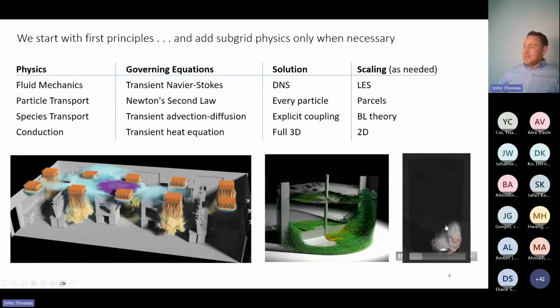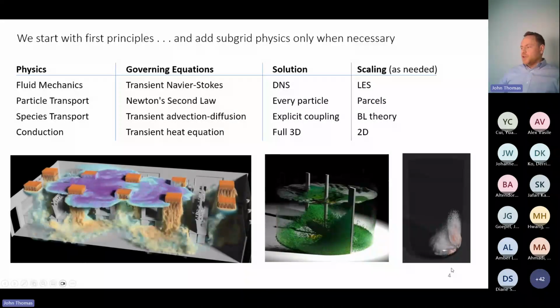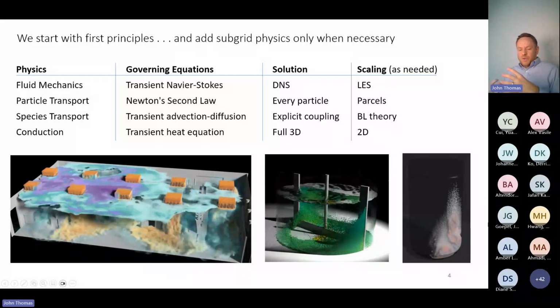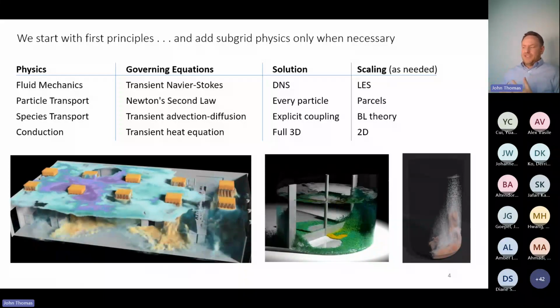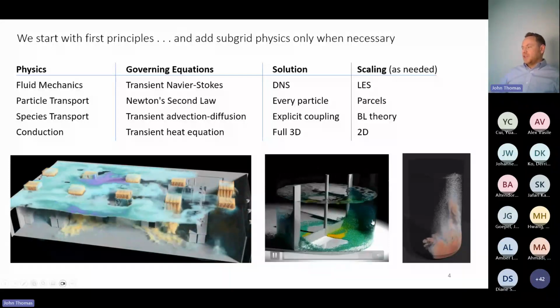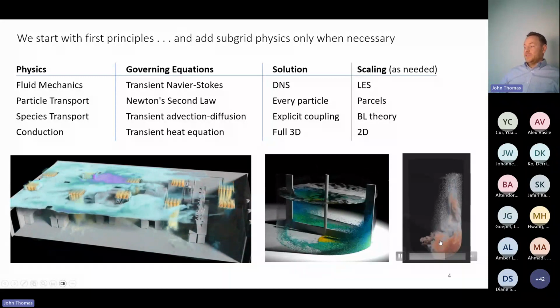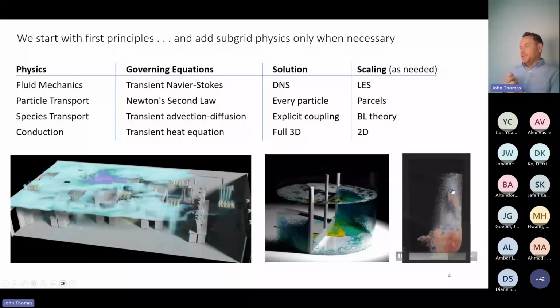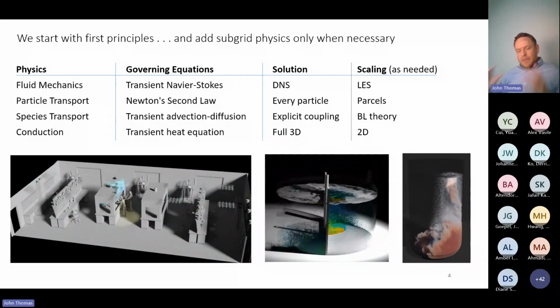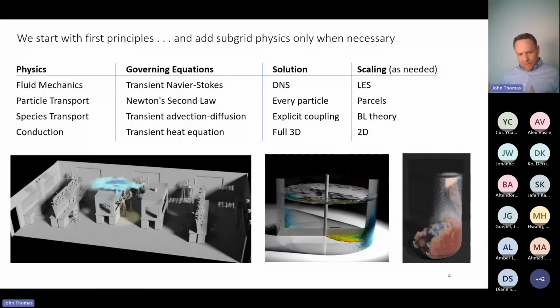Here are the bioreactors. We'll be talking a lot about these today. I'm just sparging this with dissolved oxygen. In fact, I'll show this movie later. We've got some sparge ring below the impeller, pumping gas in an effort to realize the target DO. And here we're looking at dissolved oxygen concentrations in the aqueous phase, as well as the Lagrangian bubbles moving through the system. So again, this is our level of theory. And just coming up for air here, this isn't a lookup table.